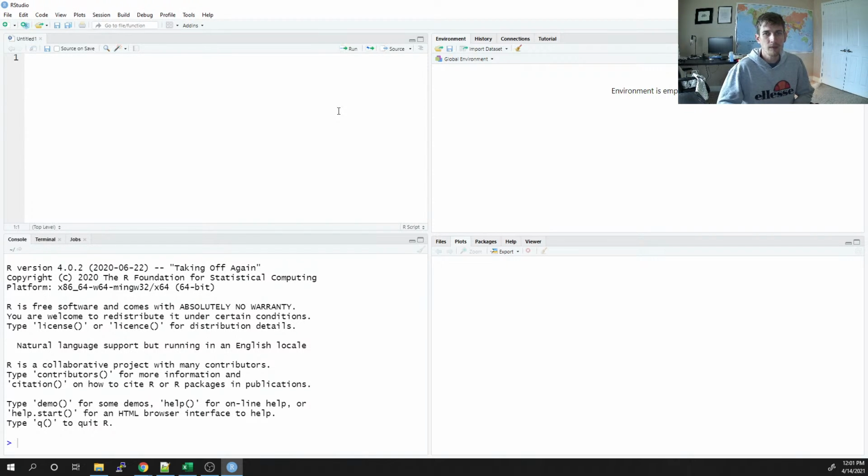From that kind of data format, we can move forward with estimating differential gene expression, or differentially expressed genes. Sometimes in the literature they get an acronym of DEGs, differentially expressed genes.